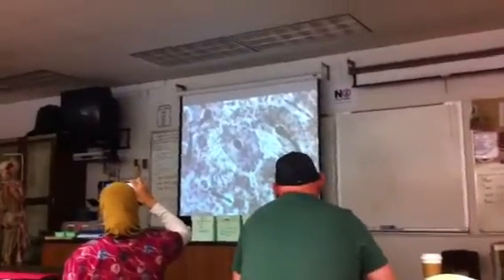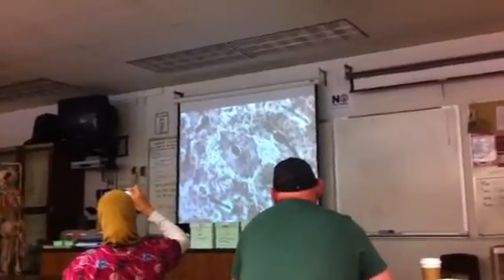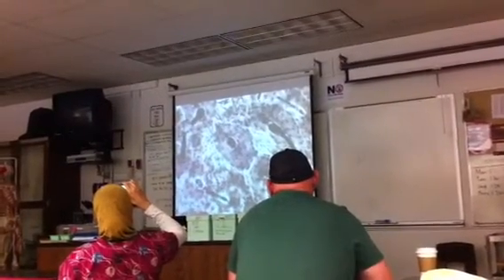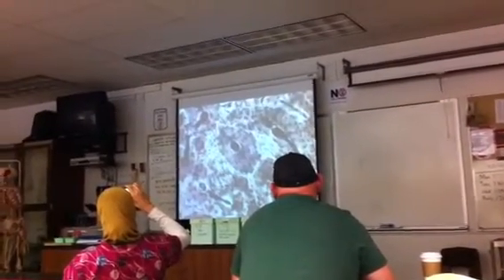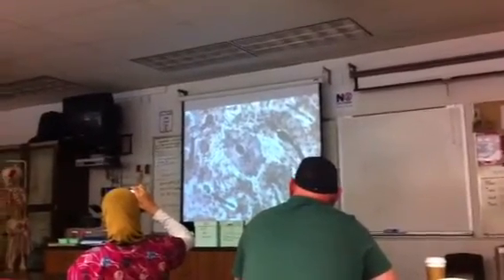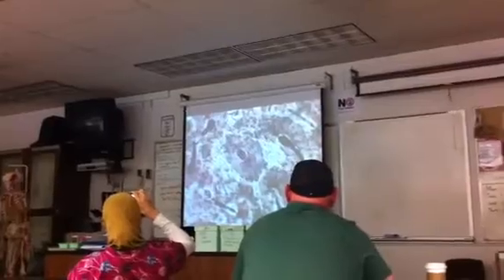Yeah, go ahead. What's the concentric lamellae again? All right, look, see how the osteocytes are arranged like tree rings? That's the concentric lamellae. And then the stuff in between is the interstitial. Michael, did you have a question?